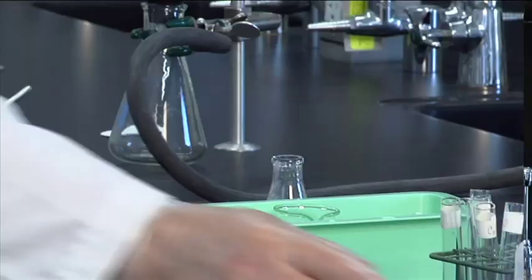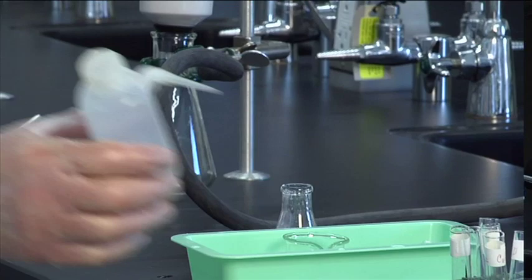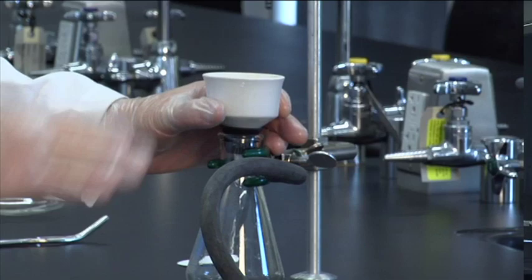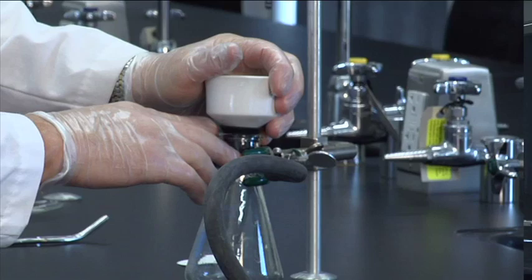All right. So I've got the vacuum on. One technique is to wet the filter paper with some DI water and that pulls the filter paper tight to the funnel. The funnel is tight to the rubber thing. The rubber thing is tight to the glass. We've got a nice tight vacuum here. So here we go.